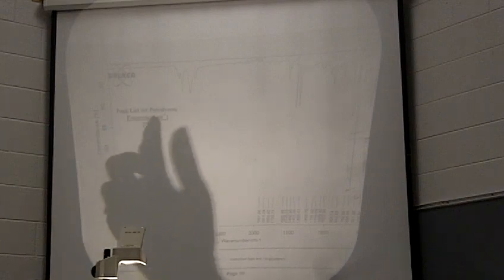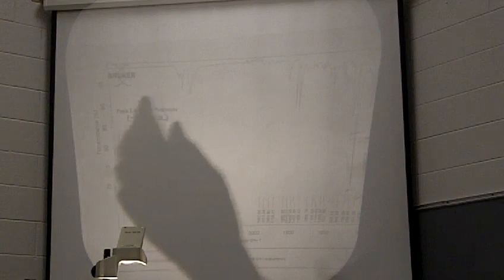What you do want to use is the spectrum itself to analyze and compare your data to the spectrum, and use this peak table to help you put your peak table together for your own spectrum. So you want to be comparing your peaks to the peaks that are listed in this peak table, okay? And again, that's on Moodle right now.